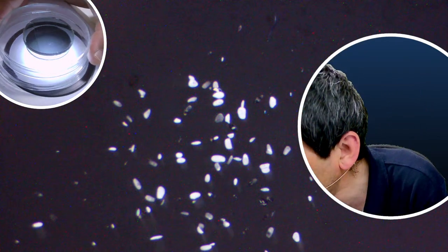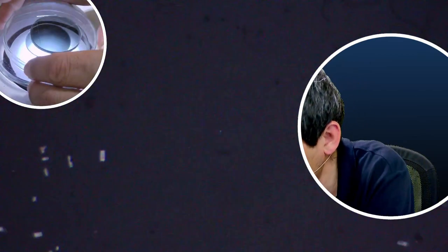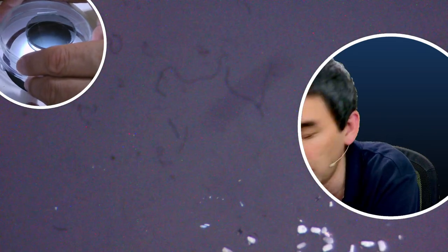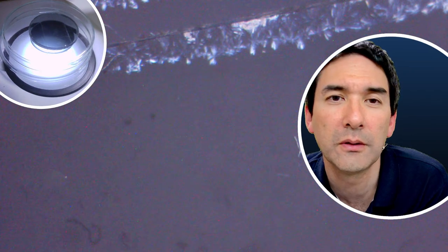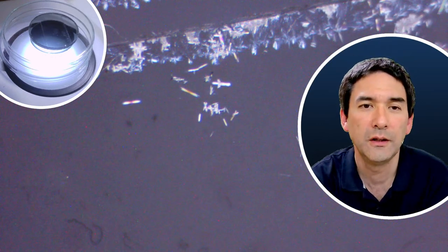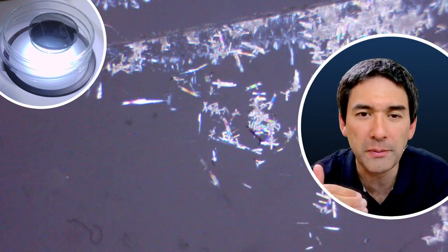Okay, so is crystallization happening now or not? Okay, why not? That's kind of interesting again. So there's always this demonstration effect that maybe here on the side. Look, there's something happening here on the side. Look. Here we go. Real time, that's fast again. So this is aspirin. Again, it's kind of choppy because the camera is kind of slow.